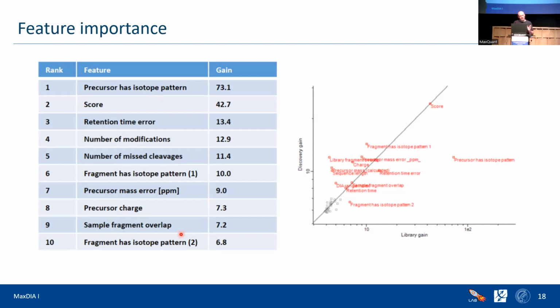I think that's also not really caught in target decoy. It is similar at the end, but completely different in the middle. That can easily happen in DIA if you're not careful about assigning the precursor.